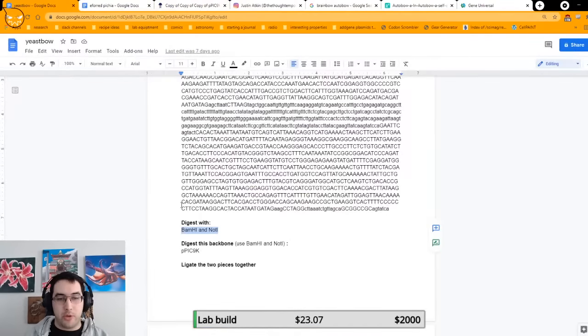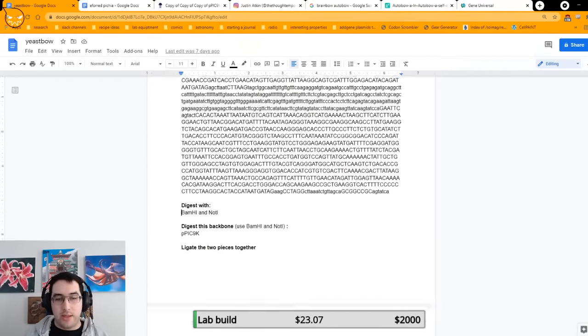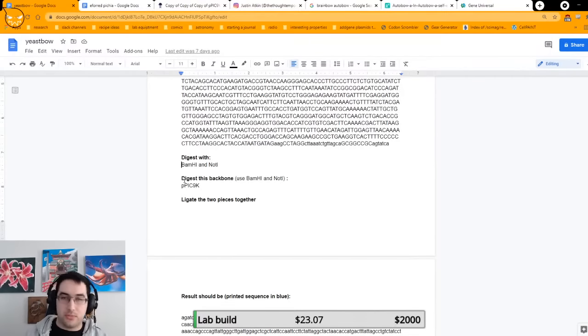So now if I go back to my Word document, you can see it says digest with BamHI and NotI. Those are the two spots where I would like them to pop the DNA open. Now I tell them digest this backbone. That's the one I just showed you. It's called pPIC9K. And these are the enzymes that I want them to use to do that. Cool. So now what we have is a backbone which has been digested and it now has dangly ends ready to accept an insert.